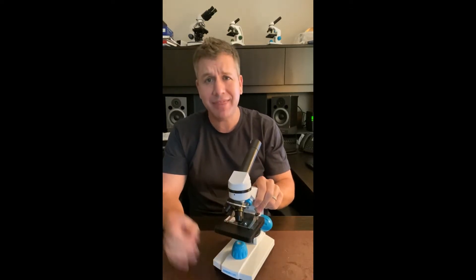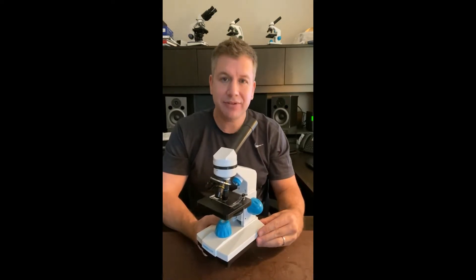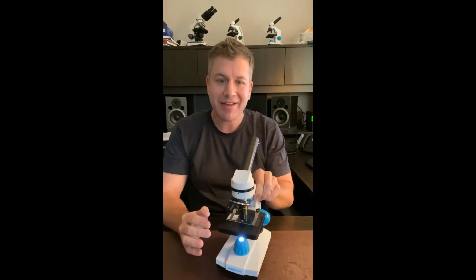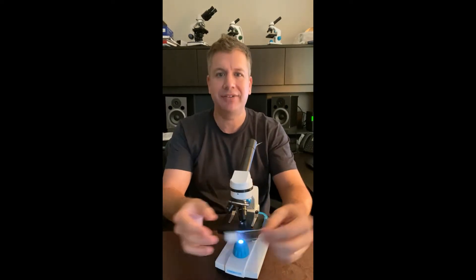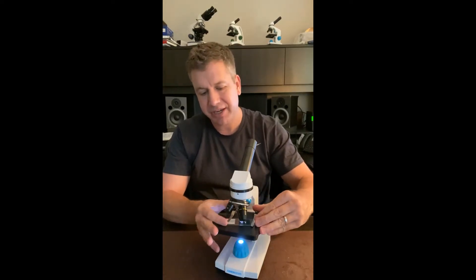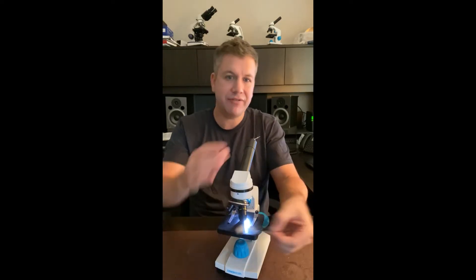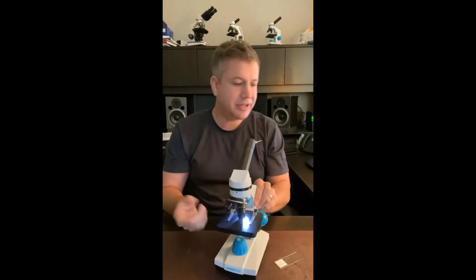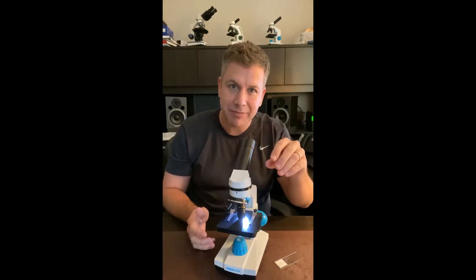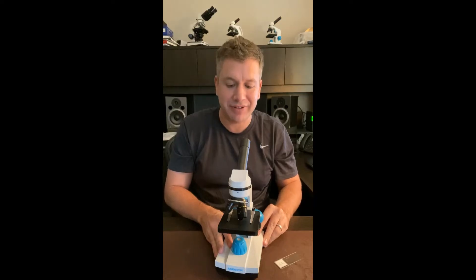So the number one thing to know: the Junior Scope has two lights, a top light and a bottom light. The bottom light is this one, and you use that for slides whenever you're looking at slides. The top light comes down from right here, and that's when you're looking at something like a coin or a bug — it illuminates it from above. That's how you use the two different lights.